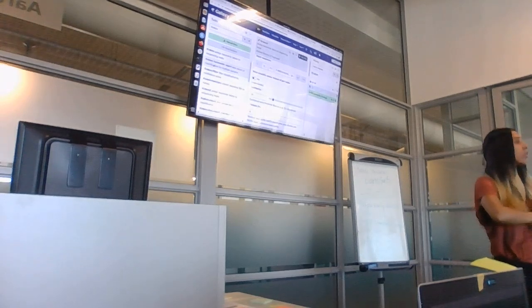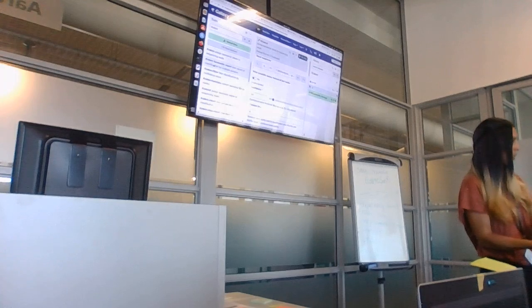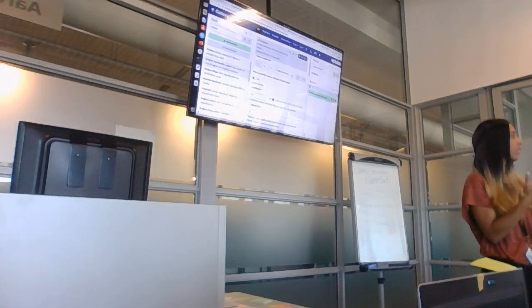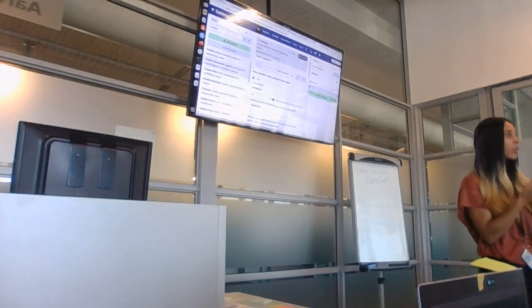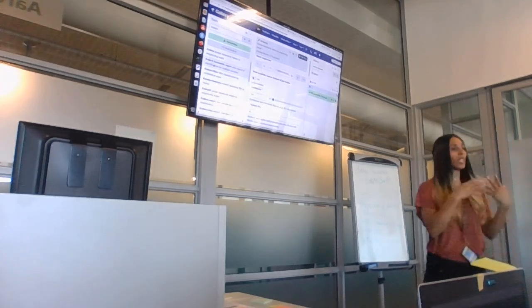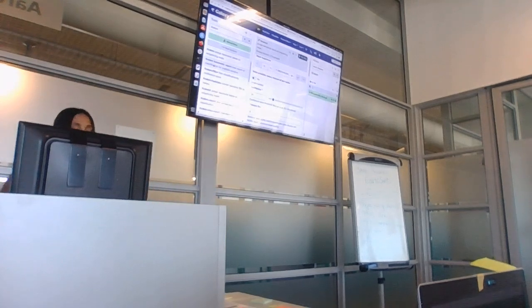You will probably look at a tutorial where somebody has run it on your specific sample and then see what they have. Because I think some people get a kick out of that. They actually like to play with tools, see how it changes, and they come up with a solution. But I left it on what was the default in other tutorials, which is 0.1. If you open this up, it's on 0. I just put it on 0.1.